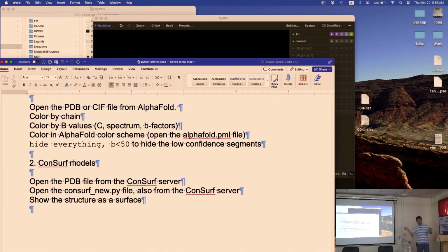So we will next learn how to morph between two structures. And for that, actually, you don't have 7RFR, right? So how do we morph between two structures? You don't have two structures. Okay, watch me for now, and then we'll do it again tomorrow. If you can download 7RFR, you can download that, but either way.